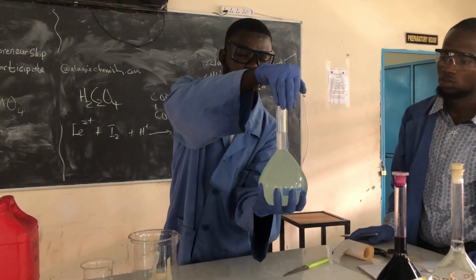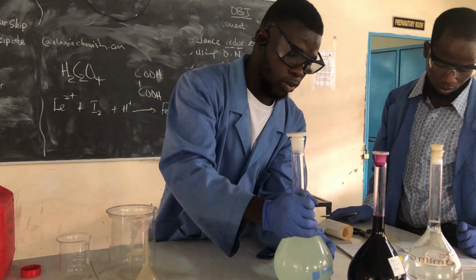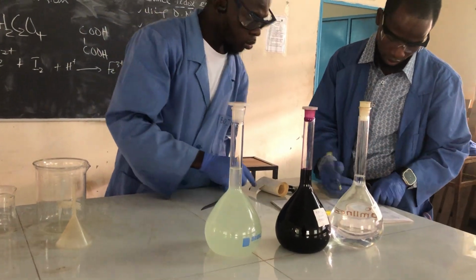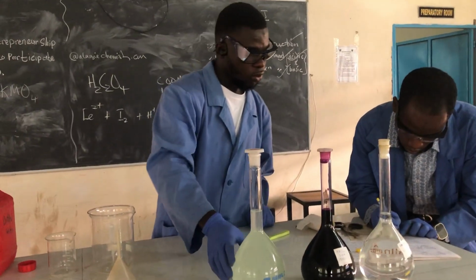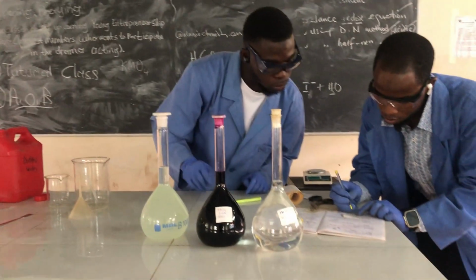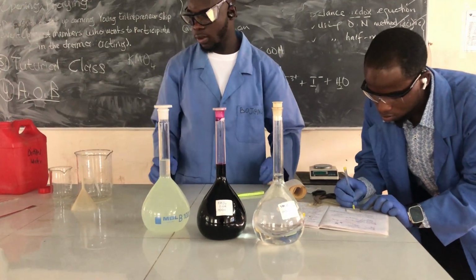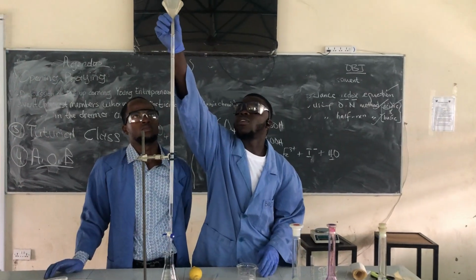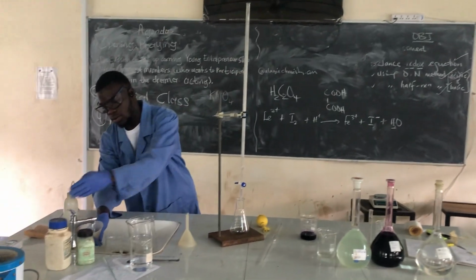So this is iron(II) tetraoxosulfate(VI). The molarity of this one is also 0.02 molarity. You can stop it. Start it. Okay.